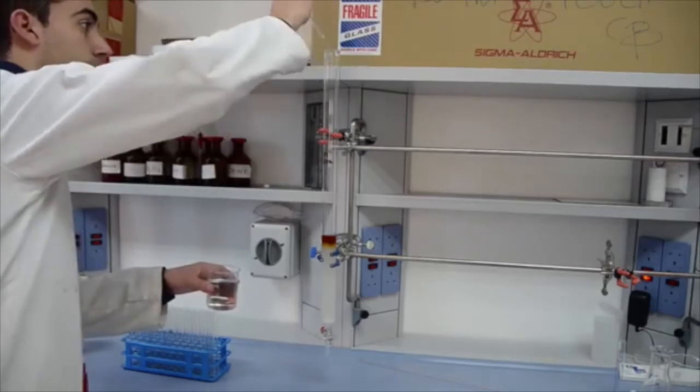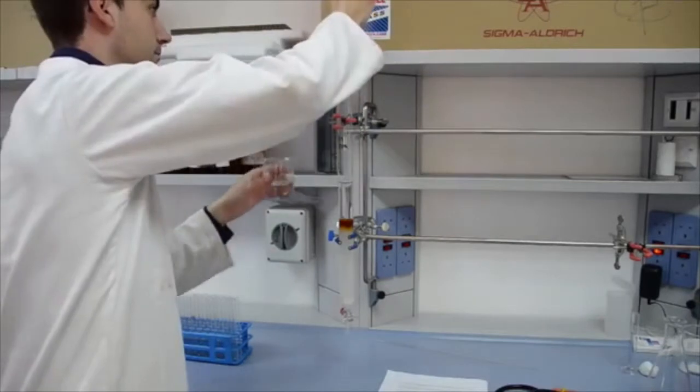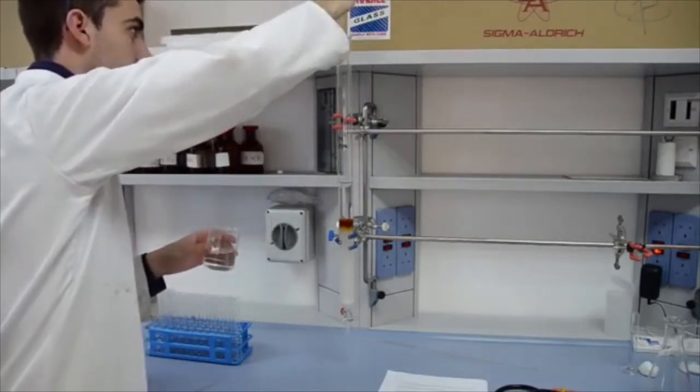Next, begin to pipette your eluent until a significant amount of solvent has been added. Fill the column with the rest of the eluent.